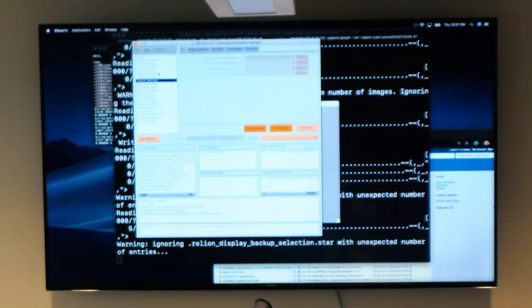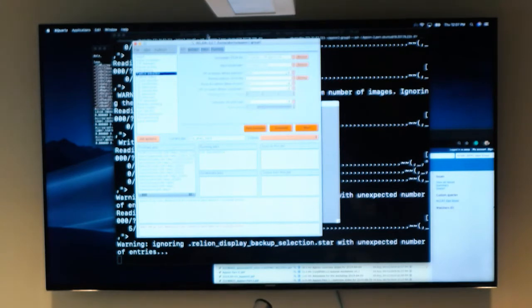I can actually go back and re-extract the star file, and I can then bin it less. So one thing is, if you have, let's say, that million particle data set, initially work with it binned. Try to do as much curation as you can, and then ideally now you're not at hundreds of millions, but maybe hundreds of thousands of particles that you can unbin, and then it'll be a little bit easier.